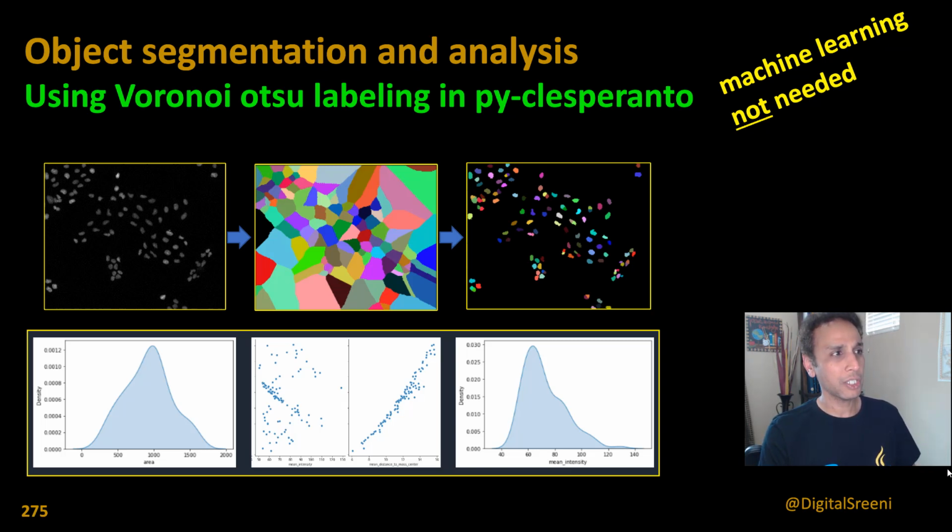And after segmentation, let's also go ahead and look at some analysis using pandas and seaborn visualization. So that's the plan for this video, and I will not try to make this very long. So let's go ahead and jump in.